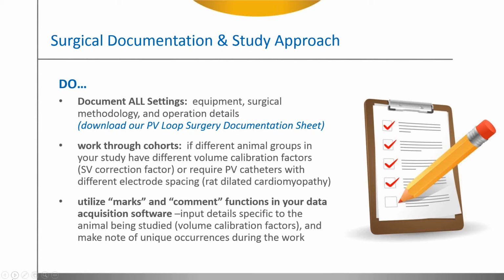For example, you can write in the file blood resistivity 1.4, heart type normal, stroke volume 21.3 microliters, and etc. Or maybe you can write the segment you used, or when you perform the occlusion, you can write occlusion 1, occlusion 2, occlusion 3, so you mark everything in your file for your later reference.